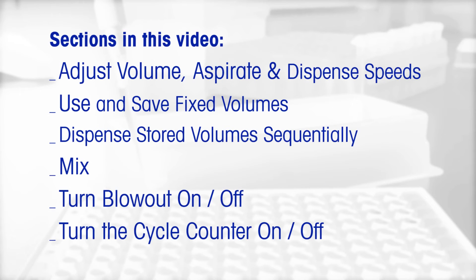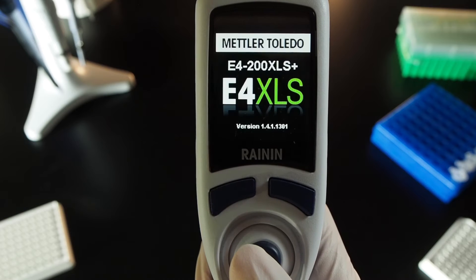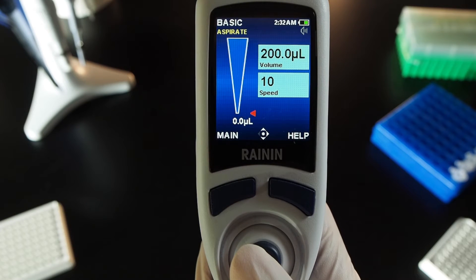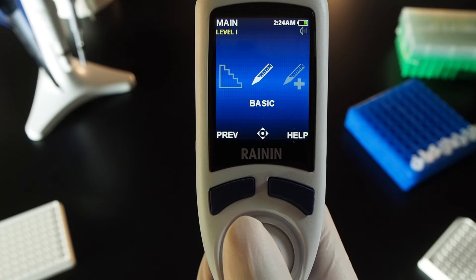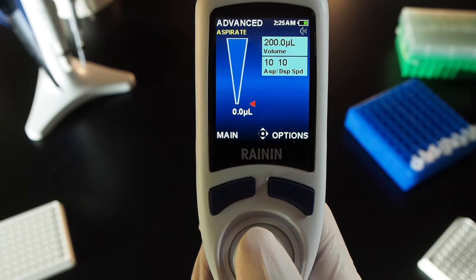Sections in this video: adjust volume aspirate and dispense speeds, use and save fixed volumes, dispense stored volume sequentially, mix, turn blowout on or off, and use the cycle counter. Press either button above the joystick to turn on the pipette, then press the button on the left. Move the joystick right or left to navigate to advanced and push the joystick up to choose it.